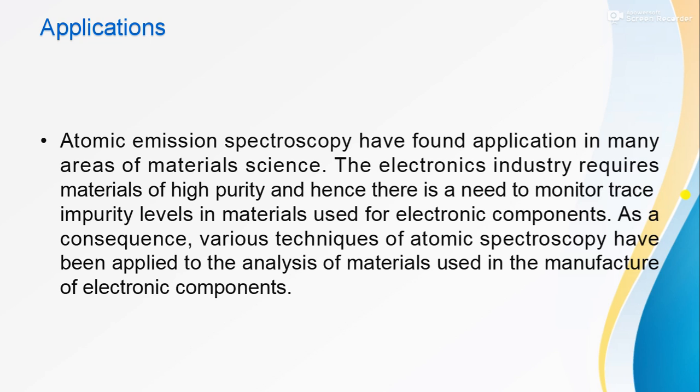Applications. Atomic emission spectroscopy has found application in many areas of materials science. The electronics industry requires materials of high purity and hence there is a need to monitor trace impurity levels in materials used for electronic components. As a consequence, various techniques of atomic spectroscopy have been applied to the analysis of materials used in the manufacture of electronic components.